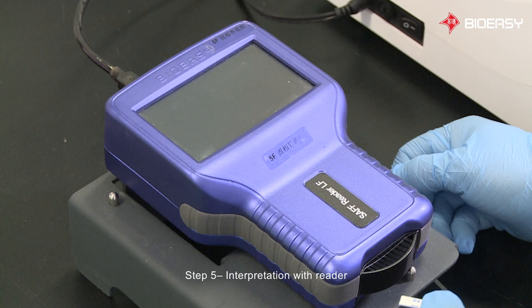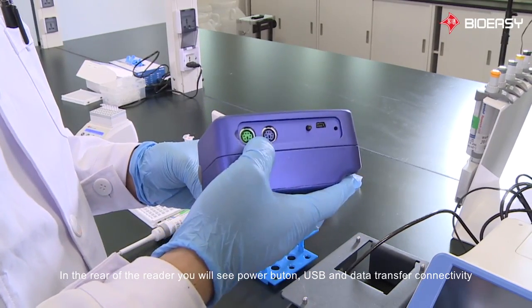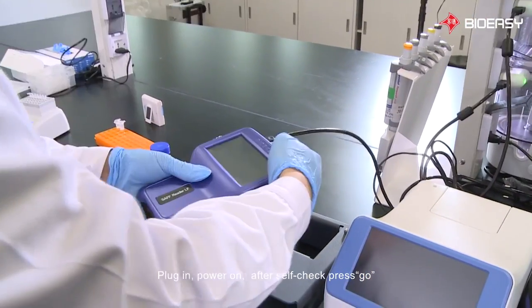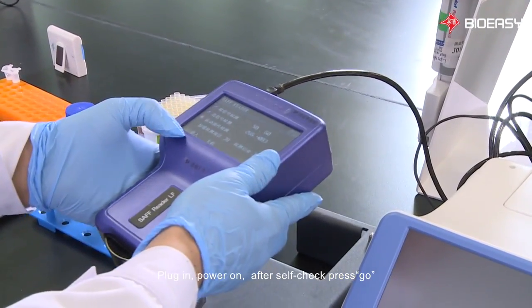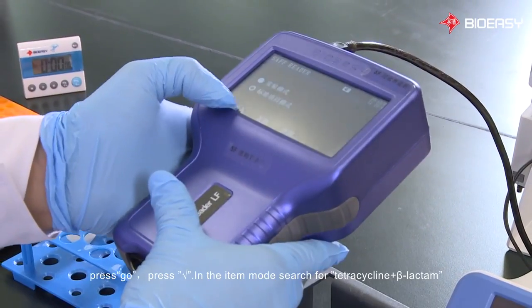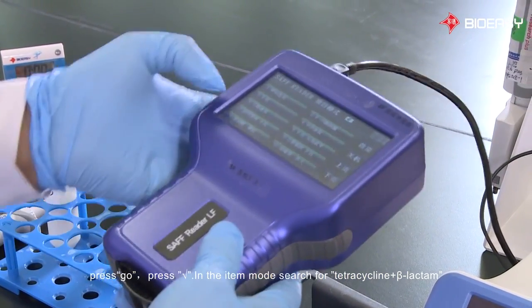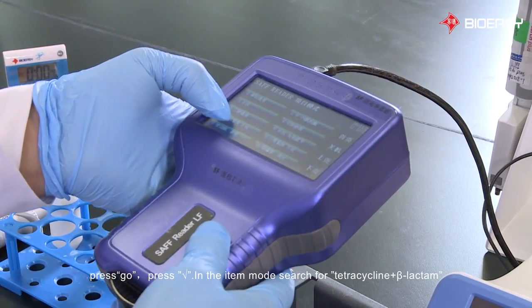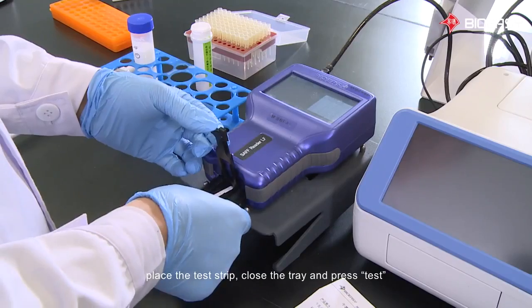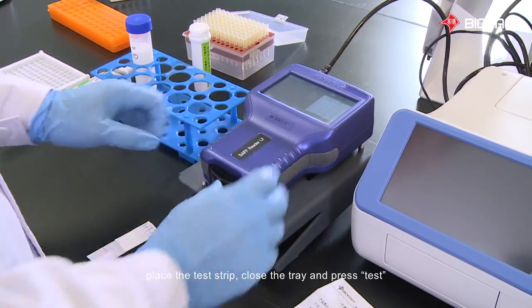Step 5: Interpretation with reader. In the rear of the reader, you will see the power button, USB, and data transfer connectivity. Plug in and power on. After self-check, press Go and choose test item mode. Press Go, then press the square root button. In the item mode, search for tetracycline plus beta-lactam. Open the tray, place the test strip, close the tray, and press Test.